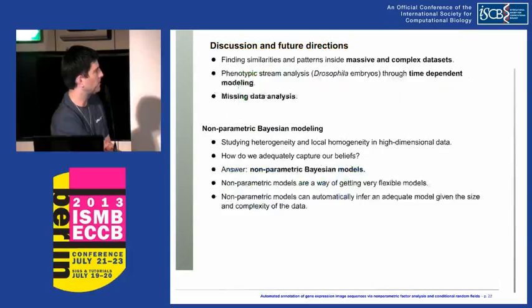And so, to wrap up, we did talk about dealing with massive and complex data sets, and I showed you this interesting factor analysis model to deal with the high-dimensional data with a smart way of extracting features. I also dealt with the time-dependent modeling, which we all have if we deal with maybe Drosophila embryos or C. elegans or even cancer progression data, and also missing data analysis.